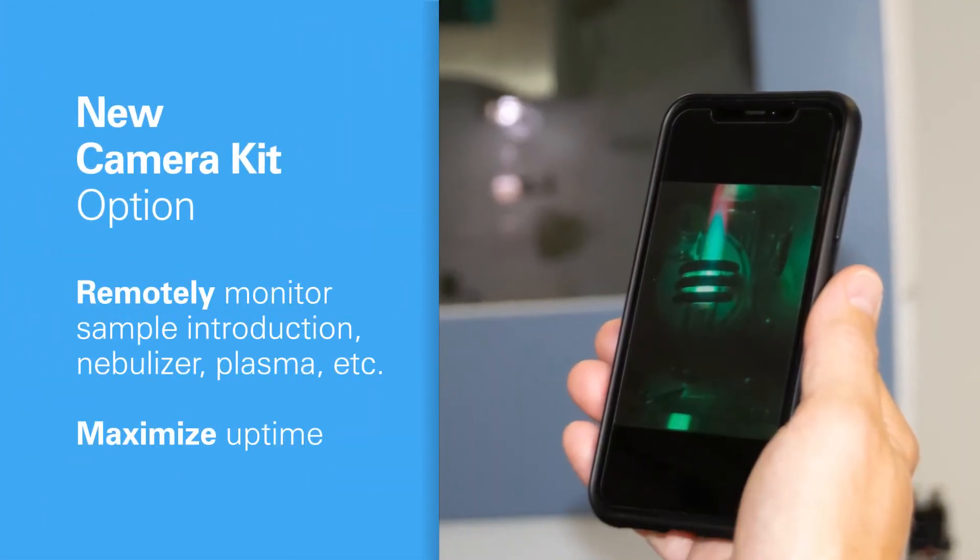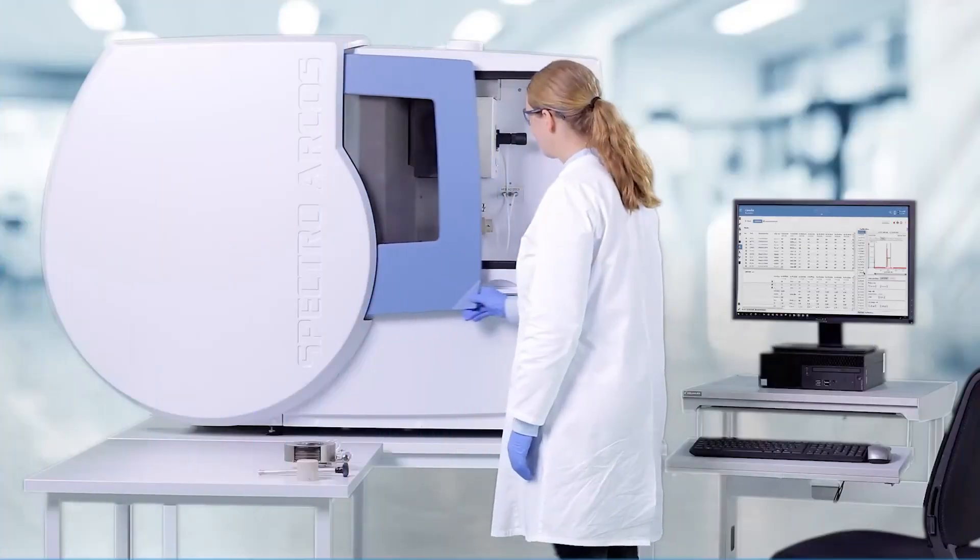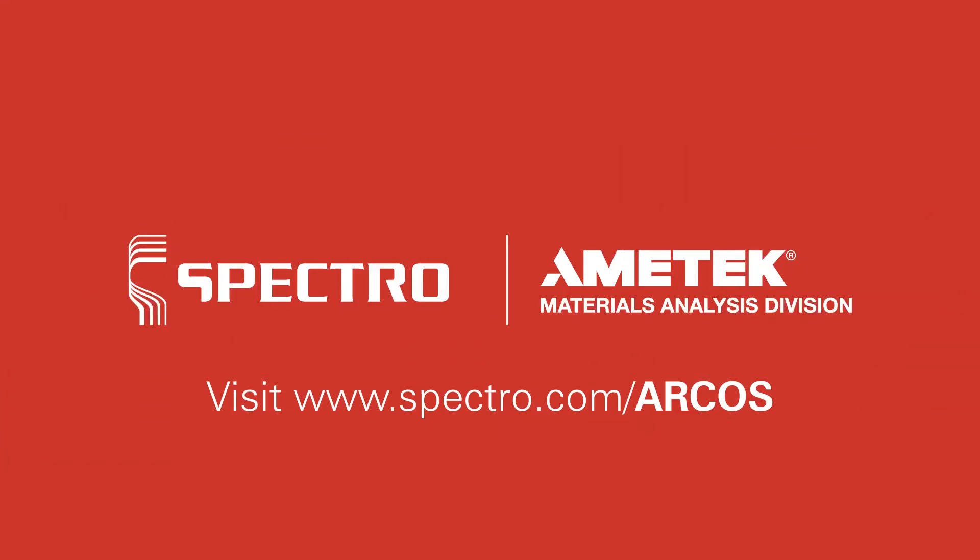Finally, for ultimate uptime, add our new optional video camera. Level up your analysis today. Visit Spectro.com slash Arcos for more on the latest amazing SpectroArcos Analyzer.